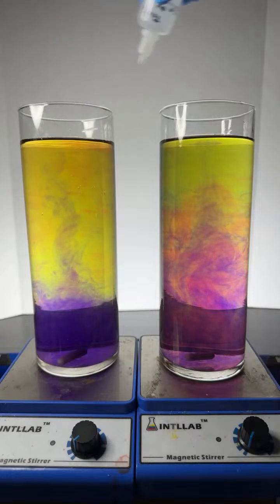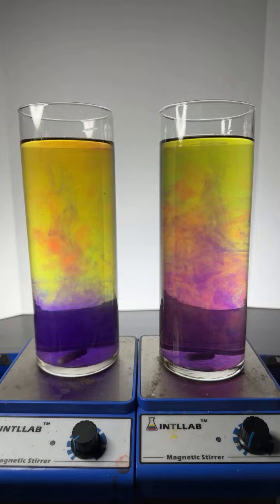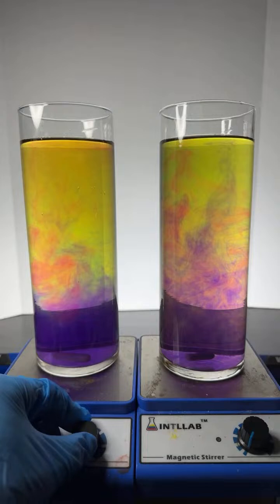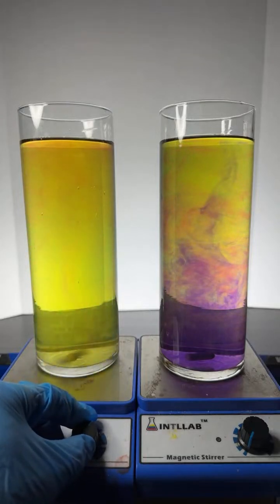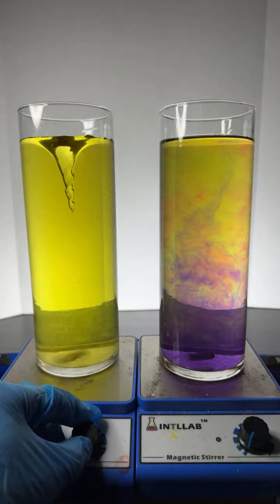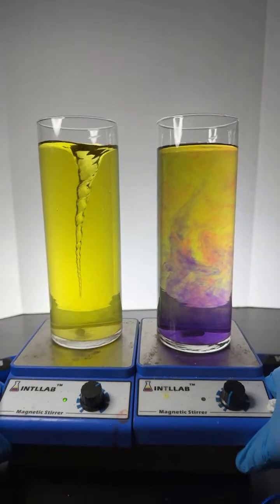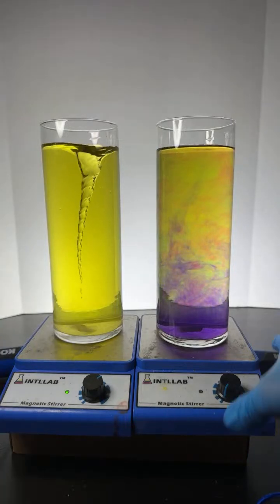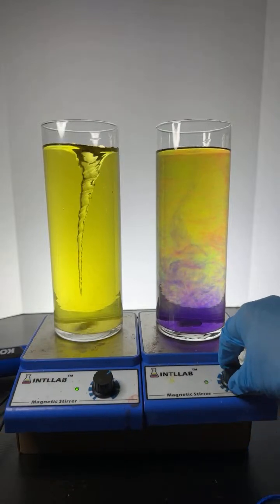All right, we're going to spin this one over here on the right, see what we get. It does look amazing. Everything go boom. Ooh, nice. Yep, looks like I almost perfectly balanced the acid and the base over there on the right. I'm going to push this back just a bit so we can see the colors better. See, we get that nice white background.